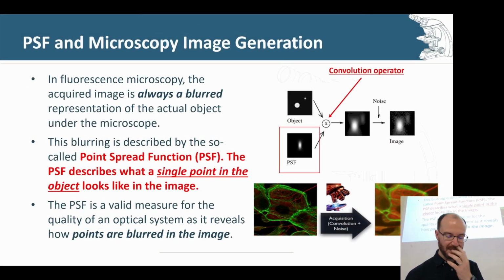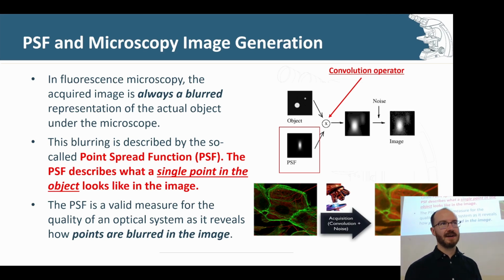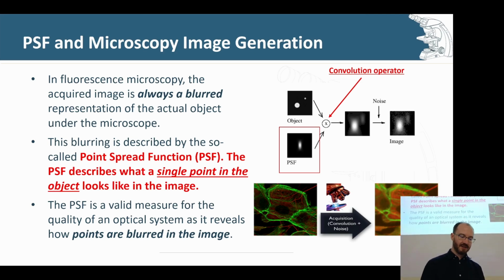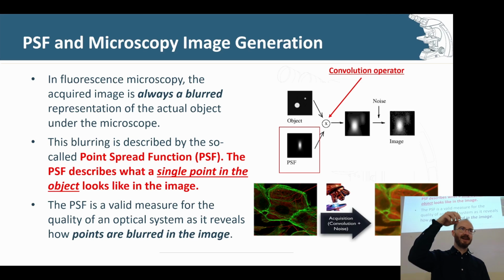Great, so we're talking now about deconvolution and what is necessary when we acquire cells. Just to explain the general approach of microscopy, you obviously have your cell or your sample, whatever you're trying to image, then you've got your sensor at the top, and the light needs to get from your sample all the way to the sensor.